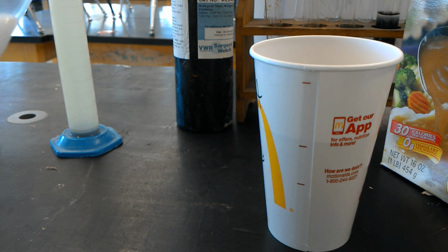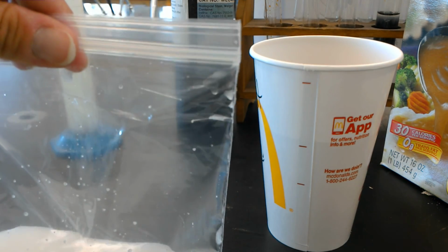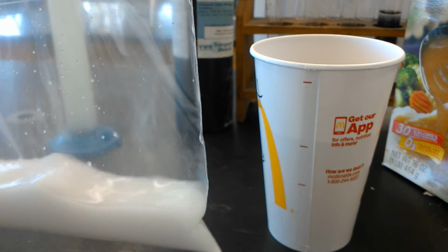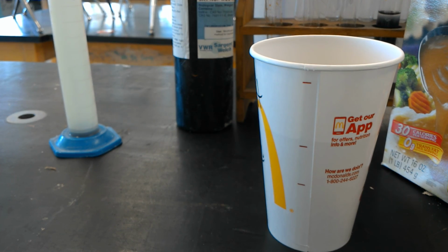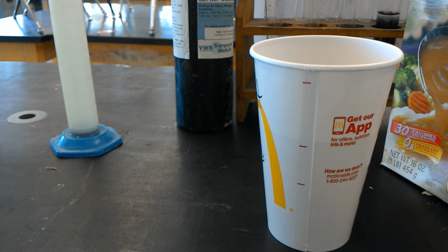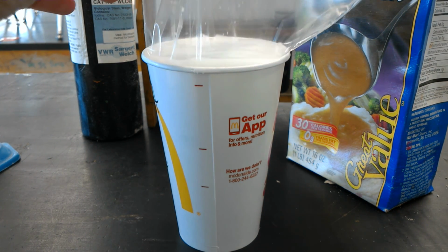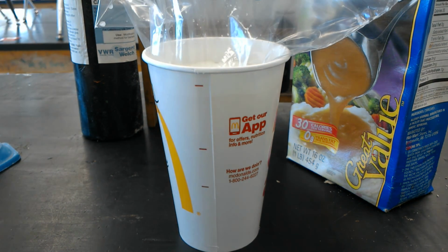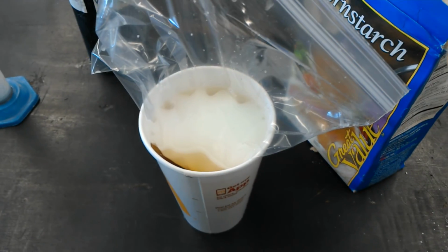And then, again, to ensure that we don't have any cross-contamination, you're going to want to take this into the sink and rinse off the outside of the bag. So we'll go ahead and do that, which I've already done. And now I have another bag for time purposes. And you are just going to put it like that. And we're just going to kind of see what we see.